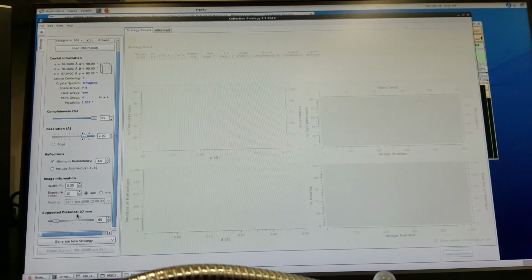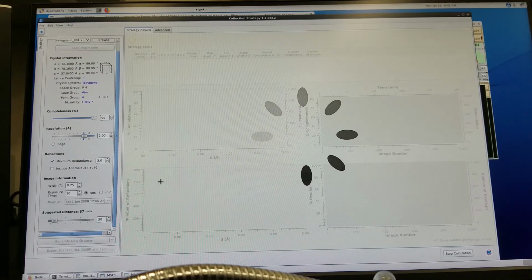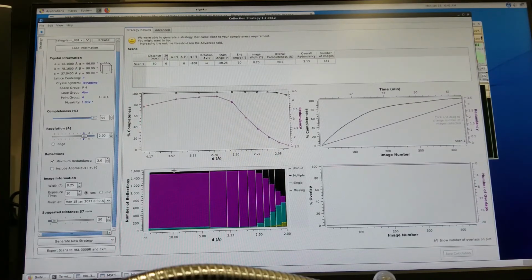And then for detector distance, it's giving us a suggestion of 37 millimeters. I feel that's awfully close, so I'm going to change that to about 50 millimeters. And then we'll generate a strategy which should be able to collect all the reflections based on that first indexed image. And here's our results. So it's figured it can do it in a single scan, detector distance of 50, and that'll allow us to have a completeness of 98.8, redundancy, and here's some graphs to predict how long it's going to take, how the completeness is going to occur over time, and the resolution of the structure.